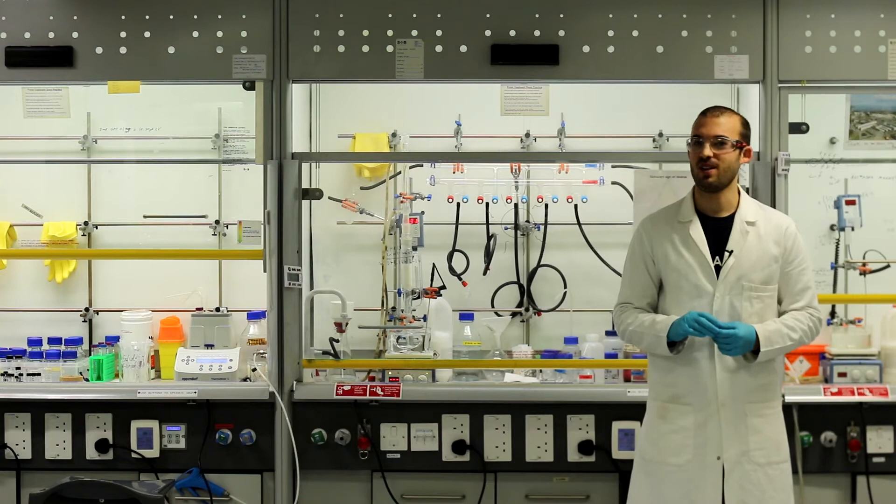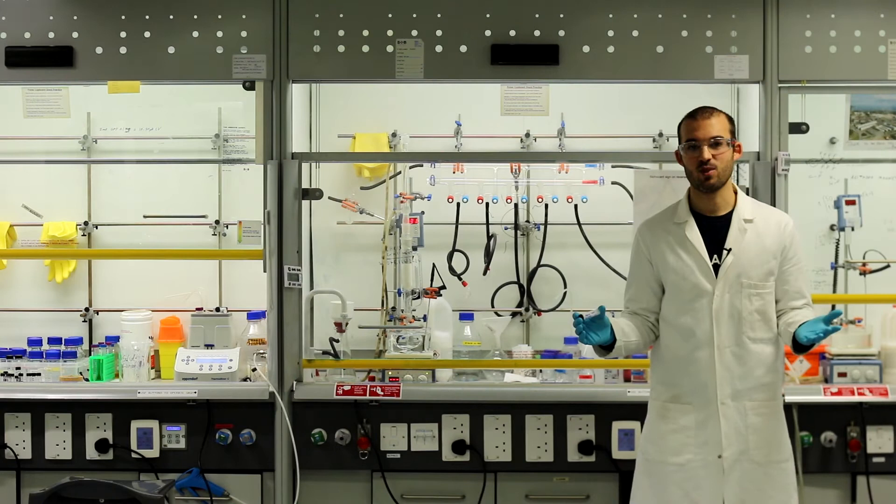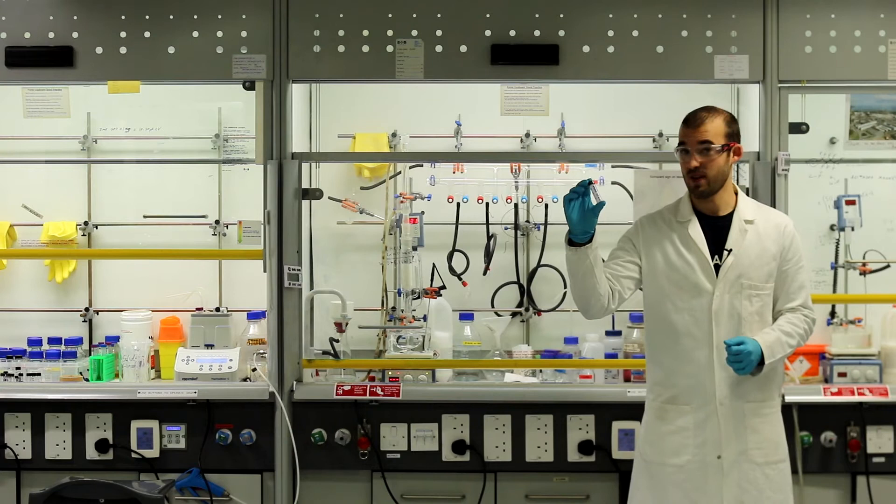Hello, my name is Alaric Taylor and welcome back to our series of videos in which we look in detail at the Langmuir-Blodgett process. We're once again in the Adaptive and Responsive Nanomaterials Lab at University College London and we will be taking a three-dimensional suspension of nanoparticles and trapping them as a two-dimensional layer at the air-water interface.